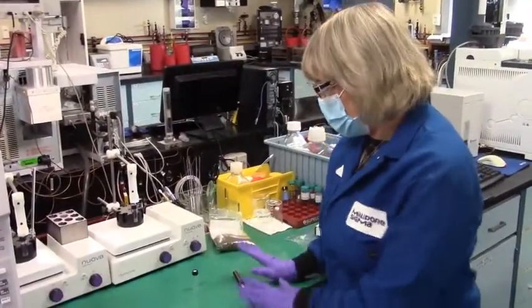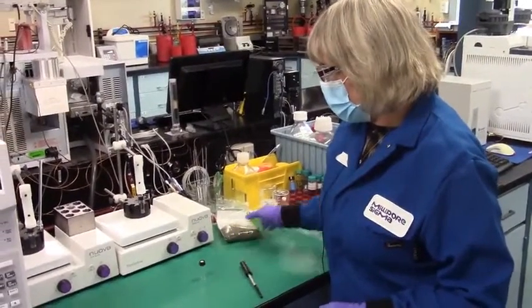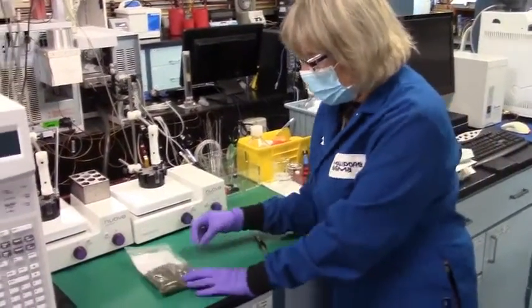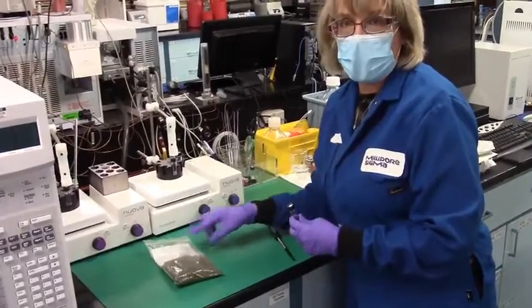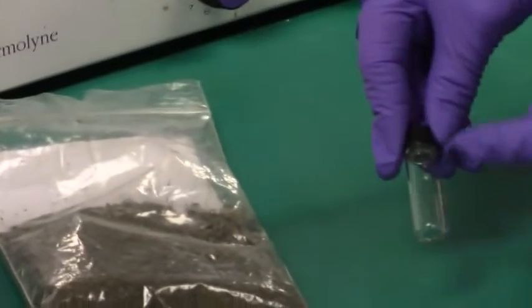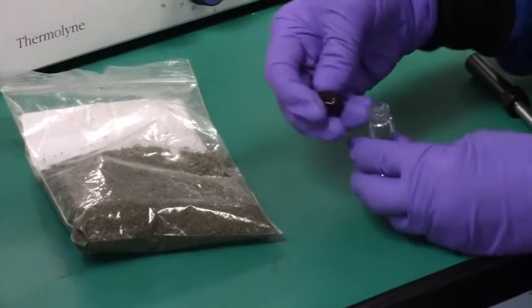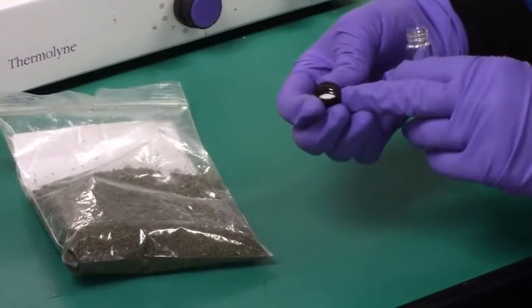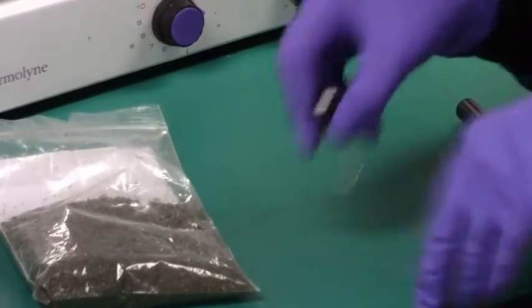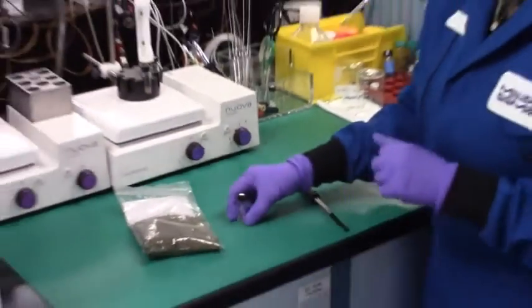All right, so I've conditioned the SPME fiber that we're going to use, and now I'm going to actually do an extraction. Now what I did before you were all here with me was I took about 115 milligrams of this hemp that I have here, this ground hemp, and I put it into this vial. This is a 4 ml vial with a septa cap, so that's a cap with a hole in it, with a nice thick septum that's Teflon lined. So that way, when the terpenes start to come off of the hemp, they'll be contained in here and they won't leak out, and we'll be able to sample them.